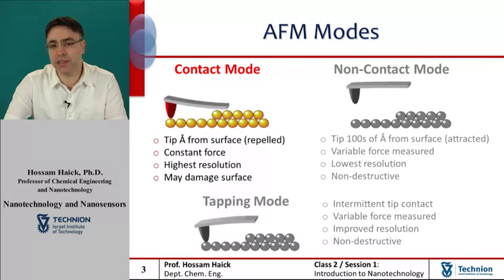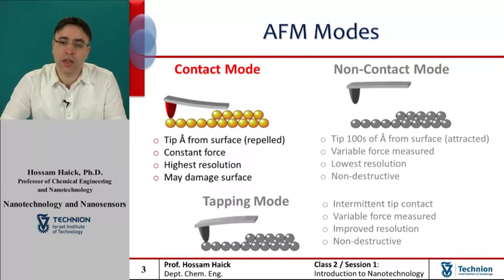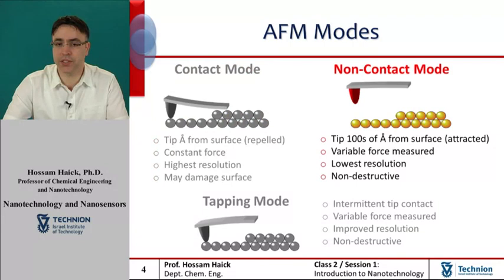On the other hand, the disadvantages include the fact that the forces can damage or deform soft samples, and therefore it cannot usually be utilized for these samples in most cases.